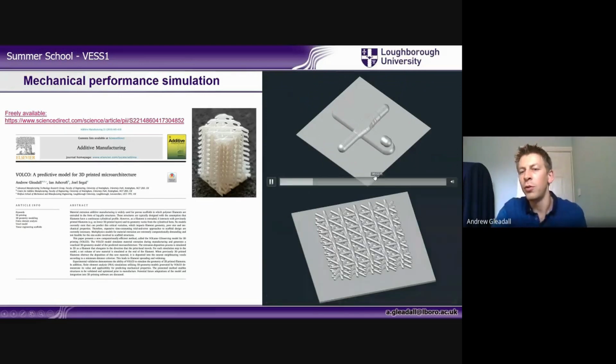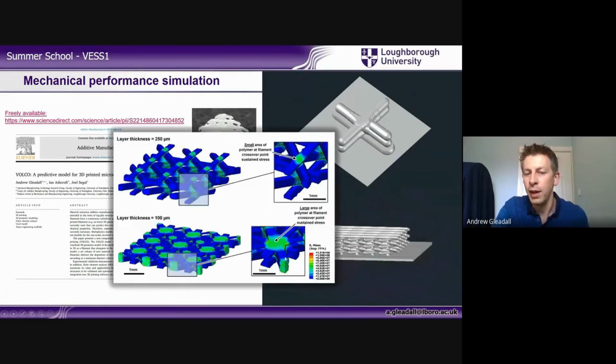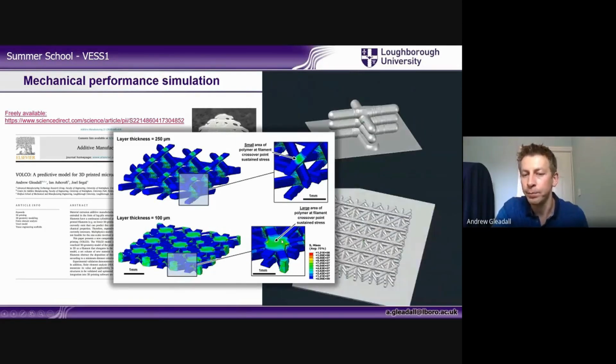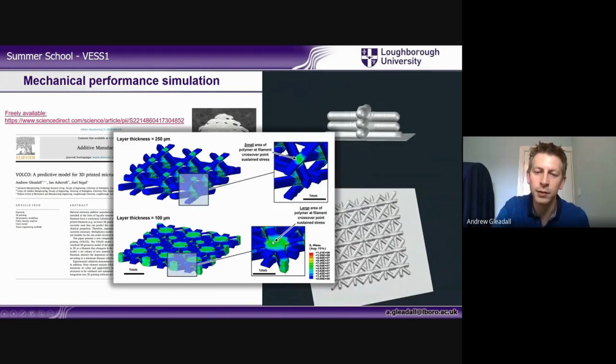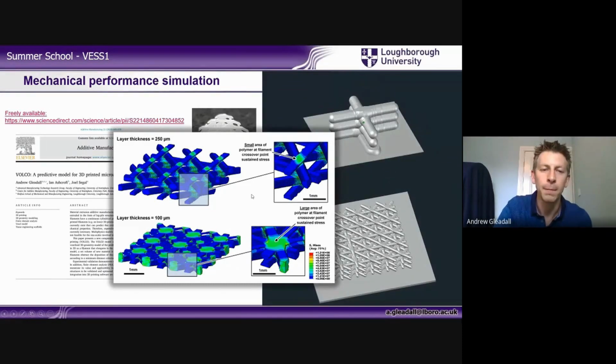So when you've got more obstruction and a larger bulging, the FEA analysis shows how you'll get a much larger area of material that can sustain the force. So you'll need to put in much greater loads to achieve the same amount of displacement, and therefore you have a stiffer structure. So this type of simulation can give a prediction, or at least indicate what the mechanical properties of different tool paths might be.